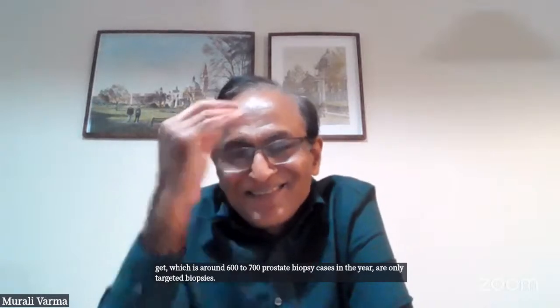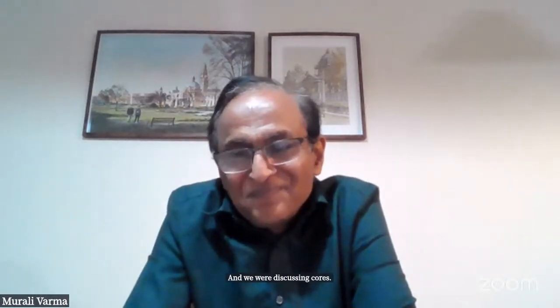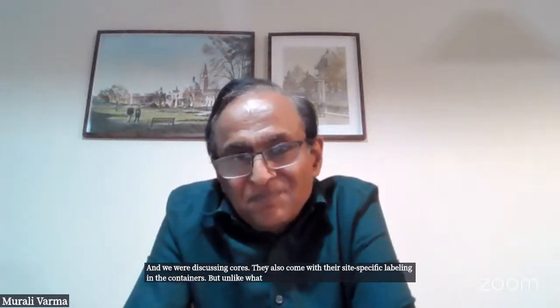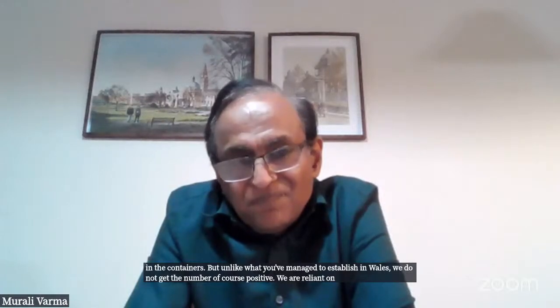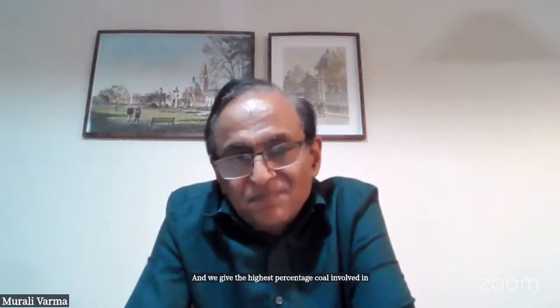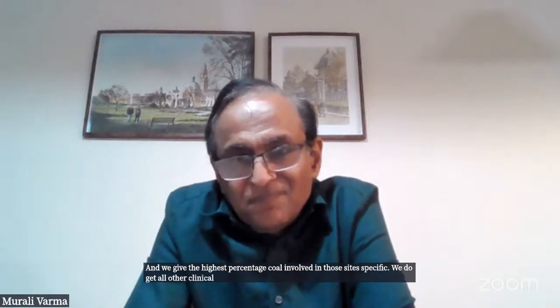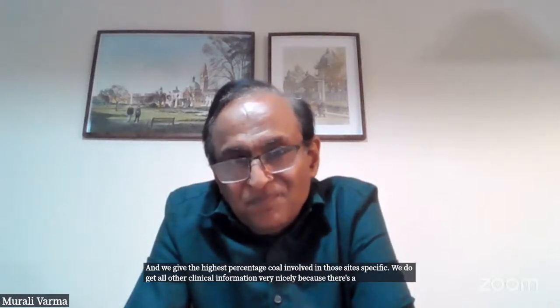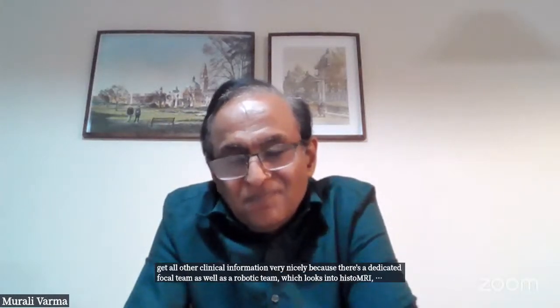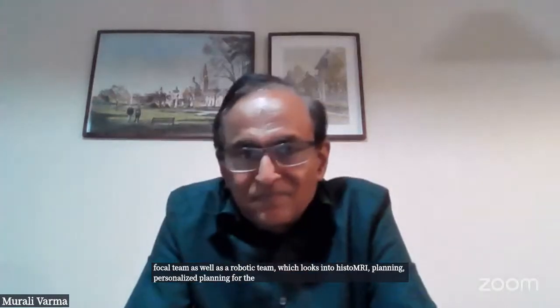And we were discussing cores. They also come with their site-specific labeling in the containers. But unlike what you've managed to establish in Wales, we do not get the number of cores positive. We are reliant on the laboratory operators telling us the number of cores. And we give the highest percentage core involved in those sites specific. We do get all other clinical information very nicely because there's a dedicated focal team as well as a robotic team which looks into histo-MRI planning, personalized planning for the surgery, radical prostatectomies of each patient.